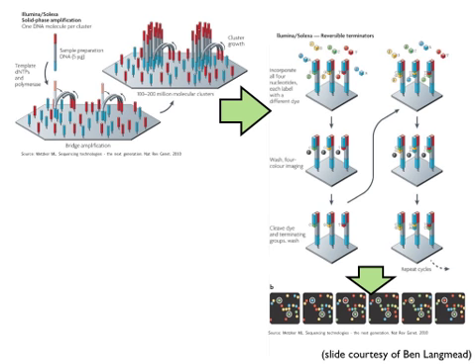So you have a location on the piece of whatever it is, glass or silicon, that is lit up, and it's being considered a cluster, a location where there are molecules. And for each cycle, you're going to take 4 pictures. One picture will light up if it's an A, the second if it's a C, then a T, and then a G. So there's 4 pictures per cycle.